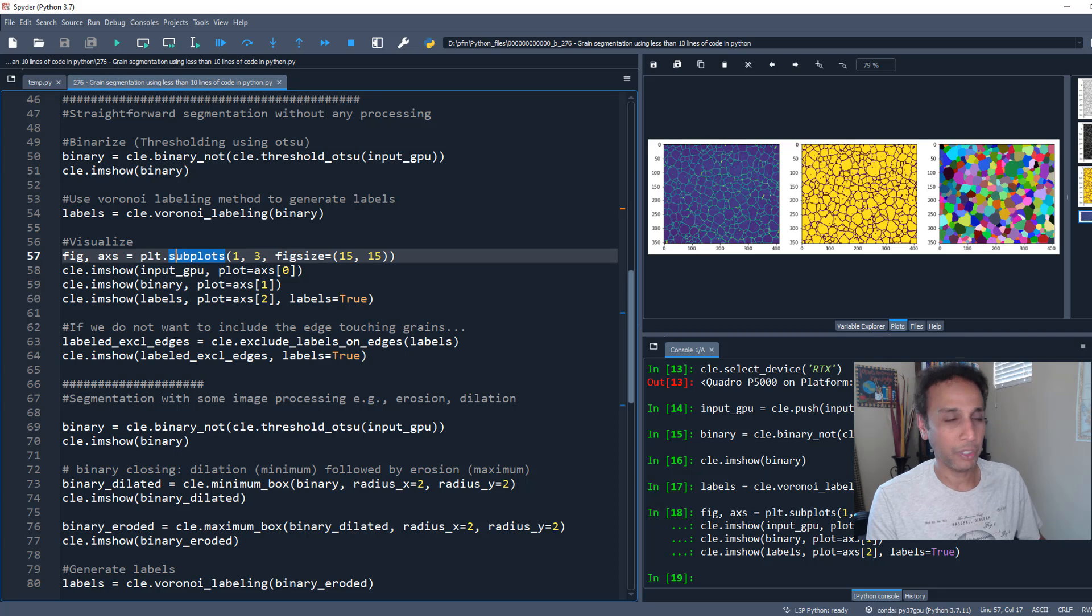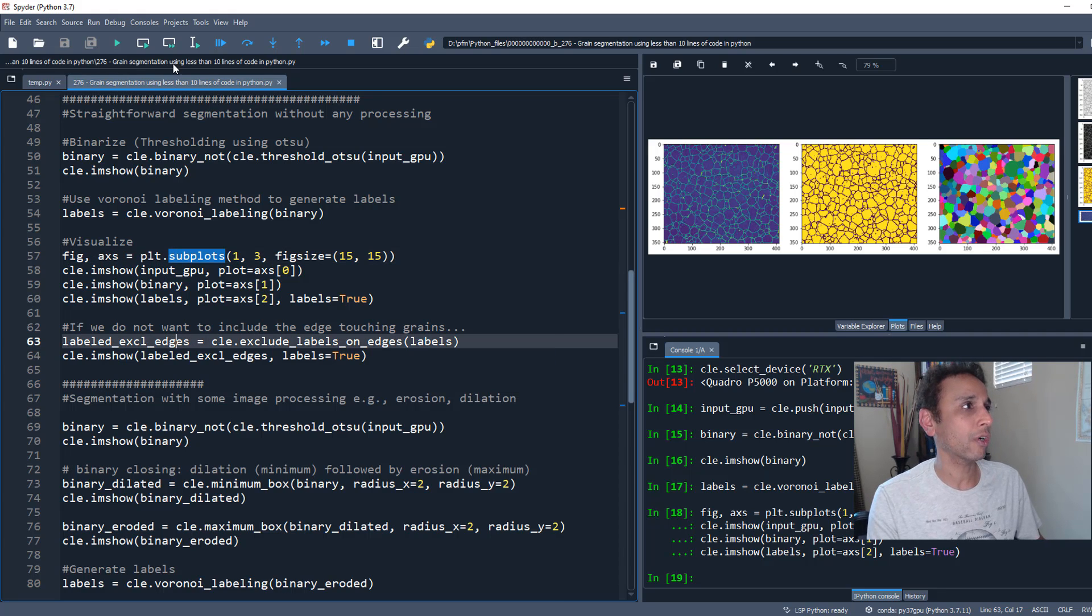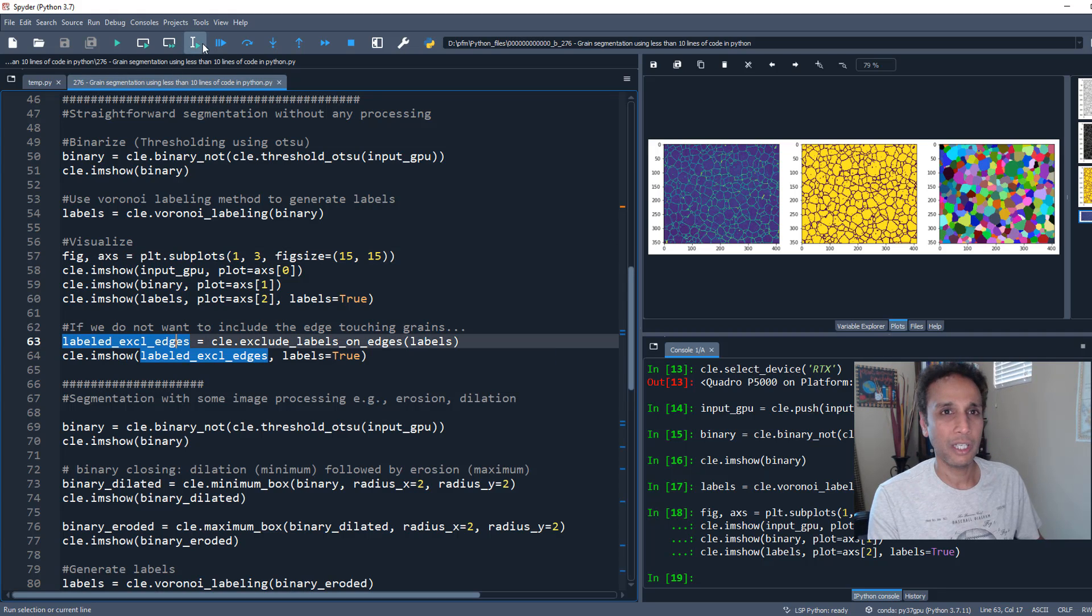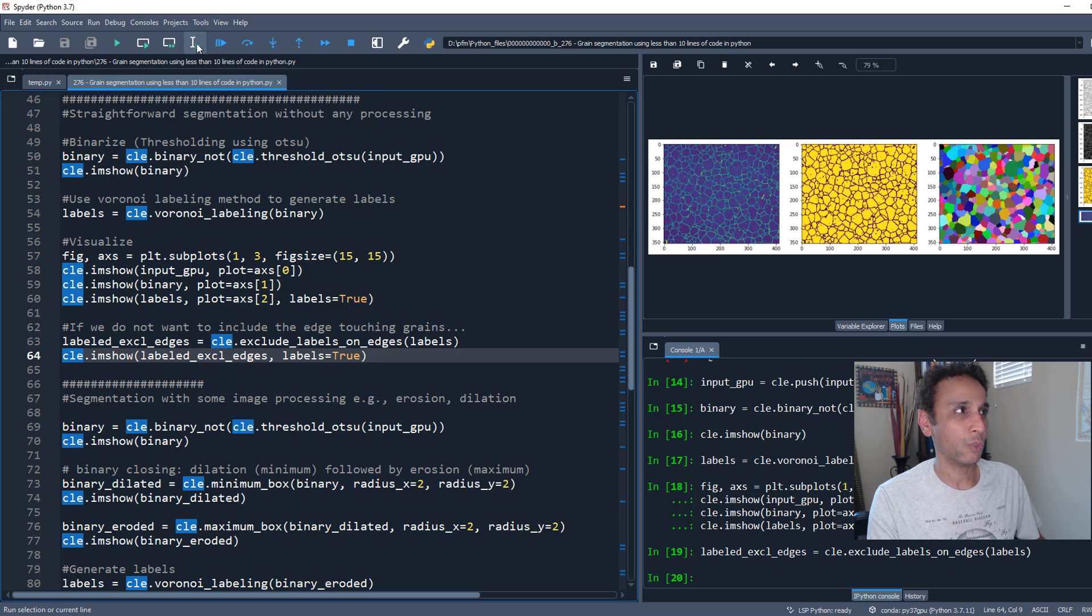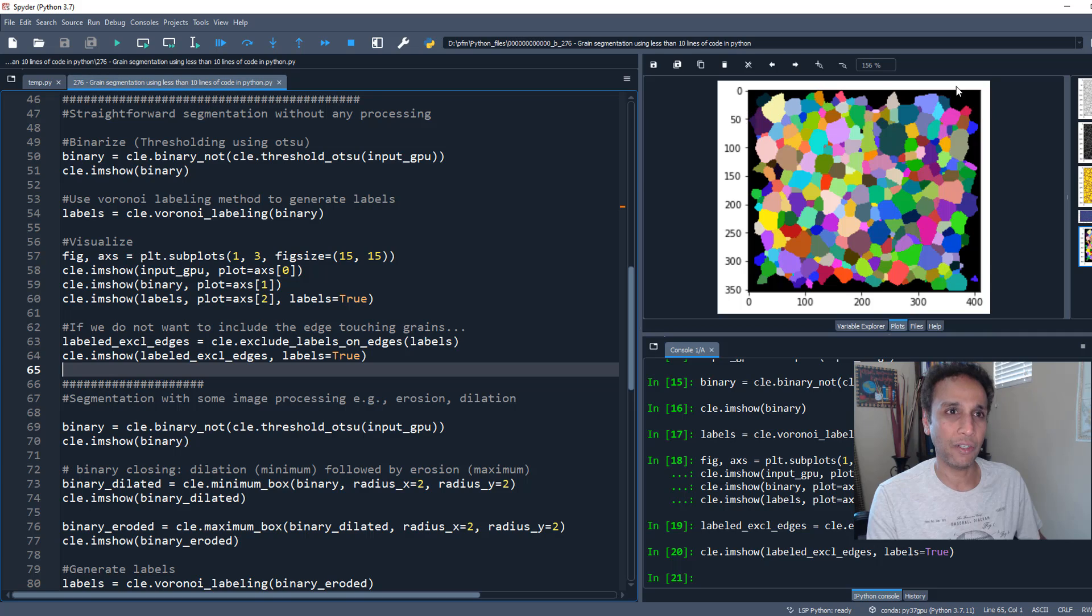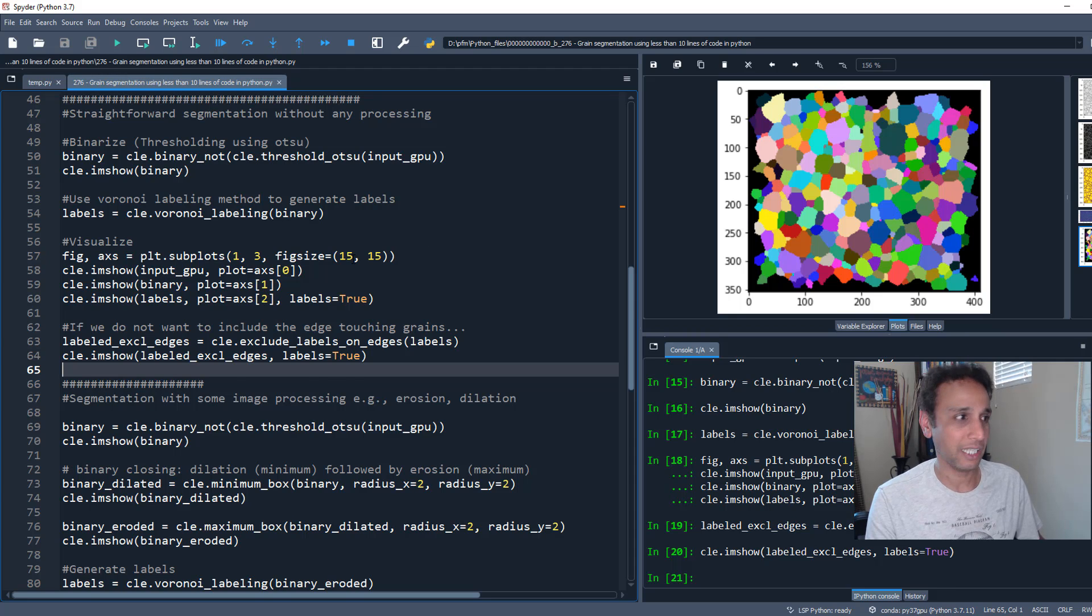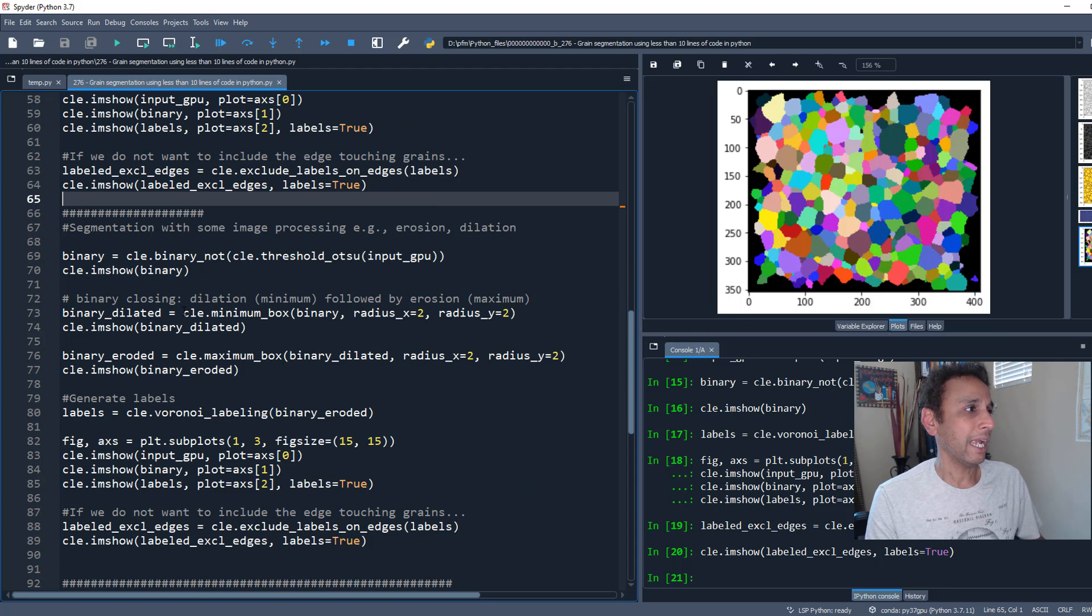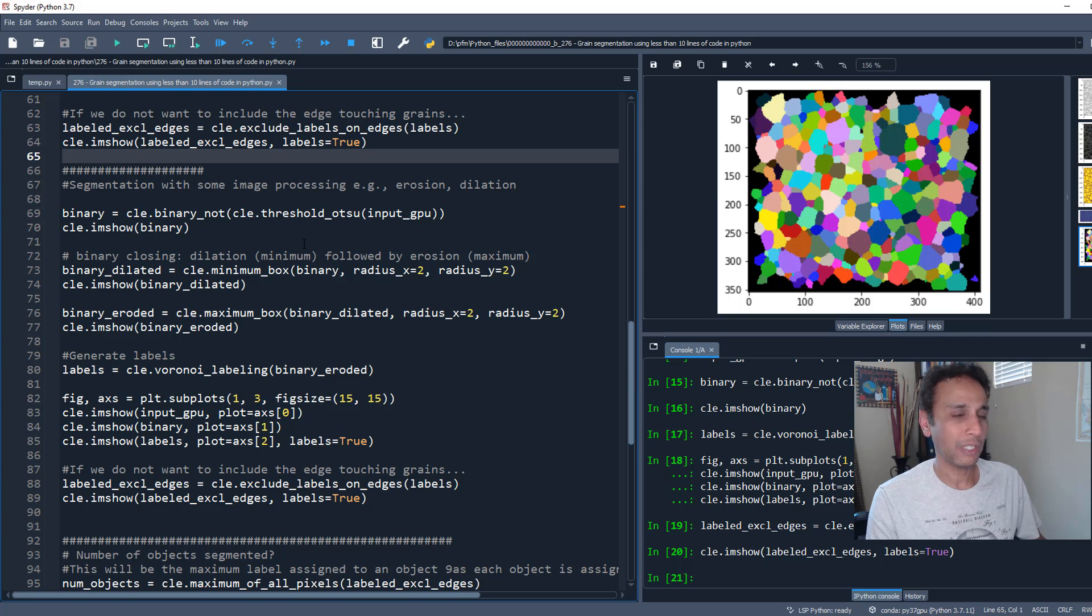You can do a few other things. You can exclude your edges - edge-touching grains - which is what I do for my grain size analysis. Here are all your grains by removing the ones touching the edges.